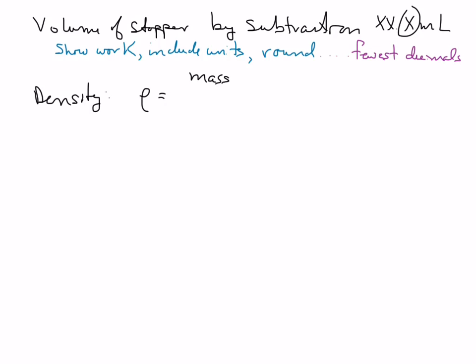The black stoppers are up here. They kind of blend in. Here's the black stoppers. So now we have the volume of the block, and we have the volume of the stopper. What I've missed in my preparation is that somewhere in there you need to get the mass of both. Getting the mass isn't too fancy. You are going to, for the first time, use our balances. We've got some nice balances over here. These read to the nearest 3 decimals of a gram, which is kind of cool.